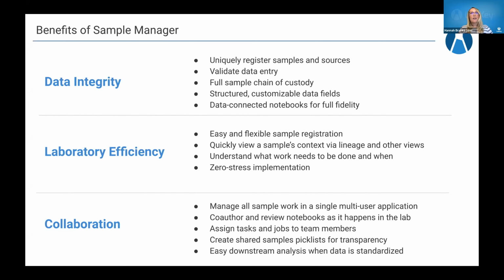And then also really focusing on that collaboration piece. Again, really ensuring that we're trying to mimic the actual physical lab environment in this digital environment, helps bring people into the tool, helps with use of the tool, and really gives that value back to the folks that are working with these applications.